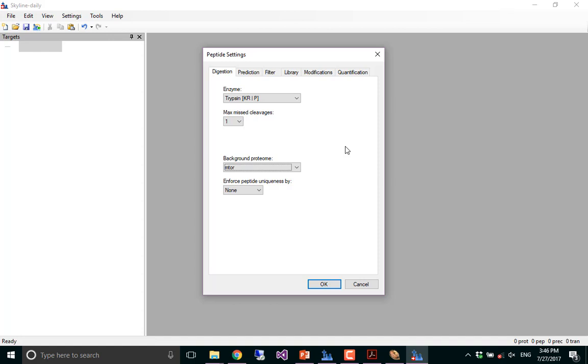Because we're basically only using it for us just to look at protein names and to match protein peptides. It's much easier to use this database because it's basically all we search. Make sense?